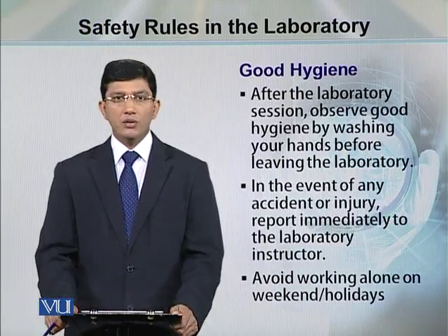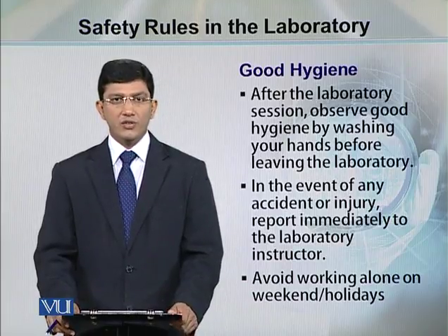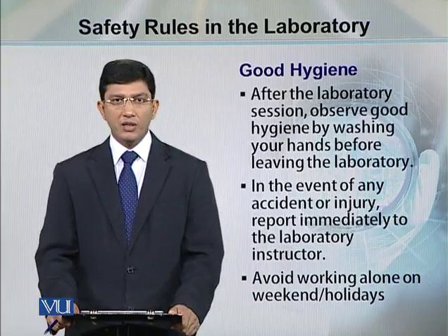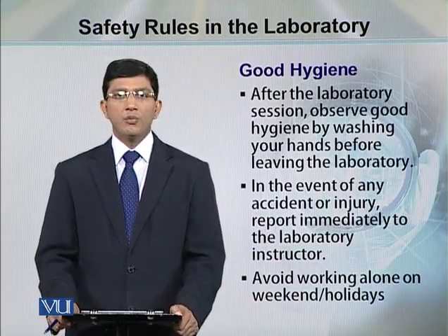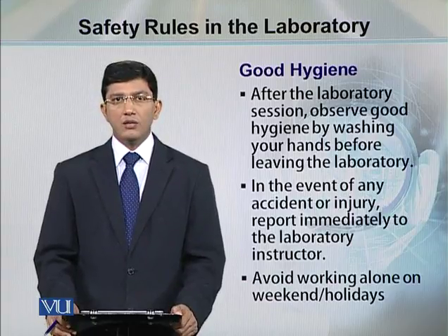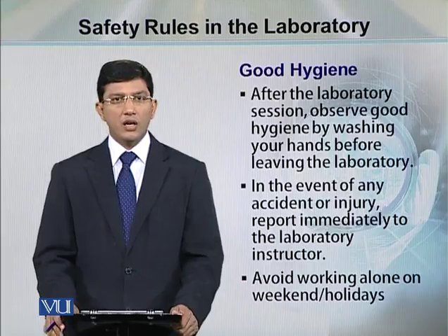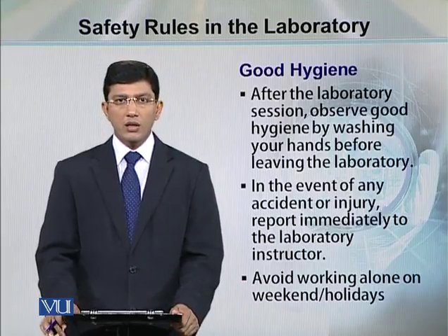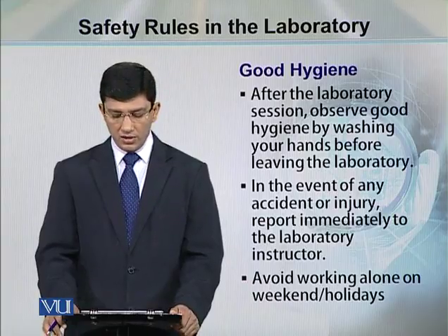Once you complete your research work and your experiment in the lab, observe good hygiene. It is highly recommended that you develop a habit of washing hands before you leave the laboratory, because while working, you have no idea what kind of microorganisms or chemicals you were working with. So prior to leaving the lab, wash your hands properly.